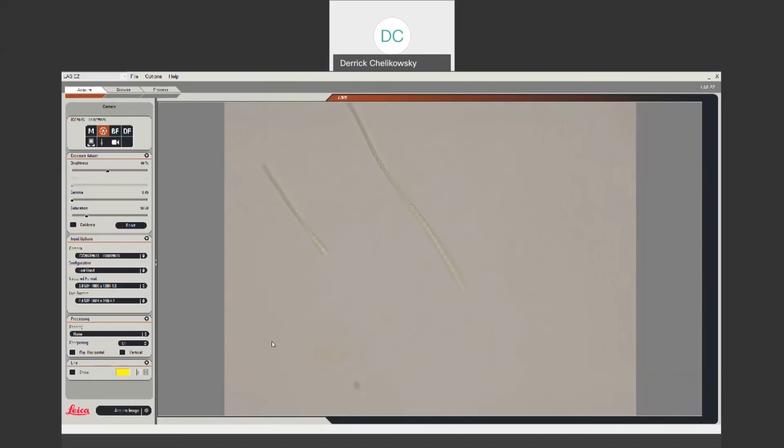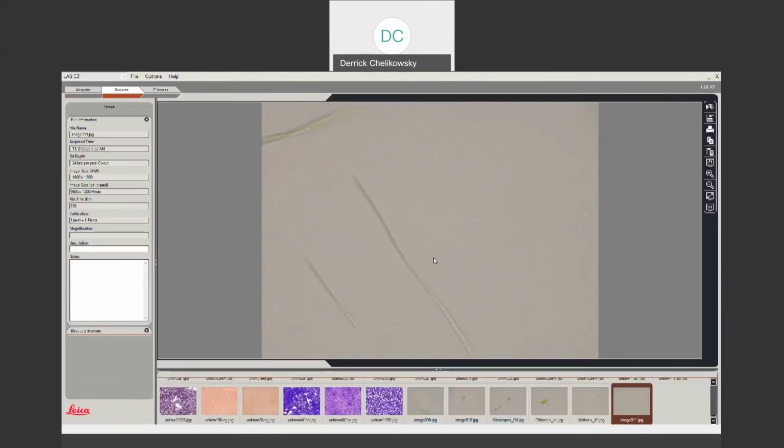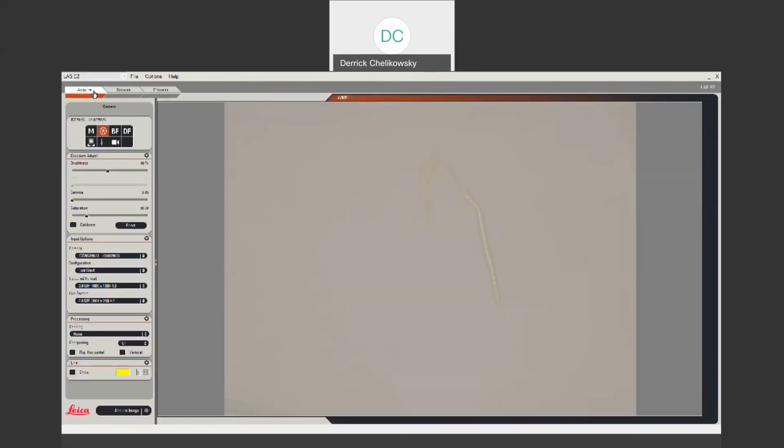We're just going to snap a photo here. Hope that it comes out properly. And yeah. Let's take a look if we can look at the ends of the Oscillatoria. Now, Oscillatoria itself is not an alga. It is a cyanobacteria, just like Nostoc was. It reproduces by fragmentation, and here's really what I want to take a look at, the ends.